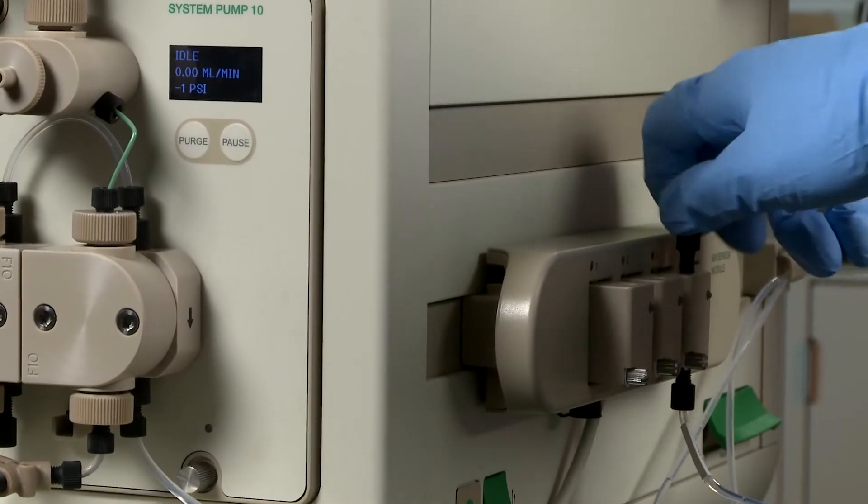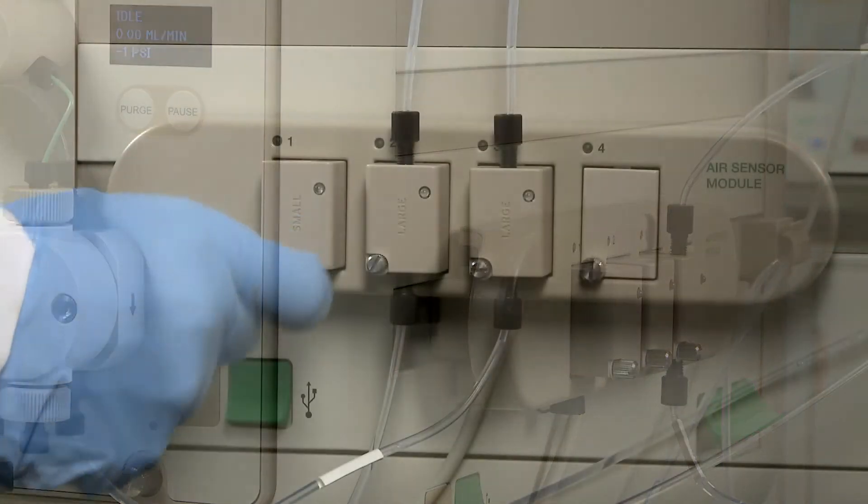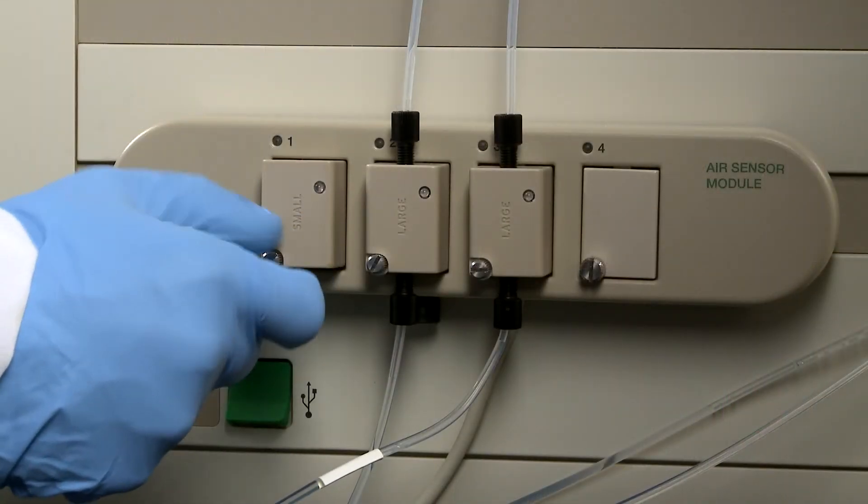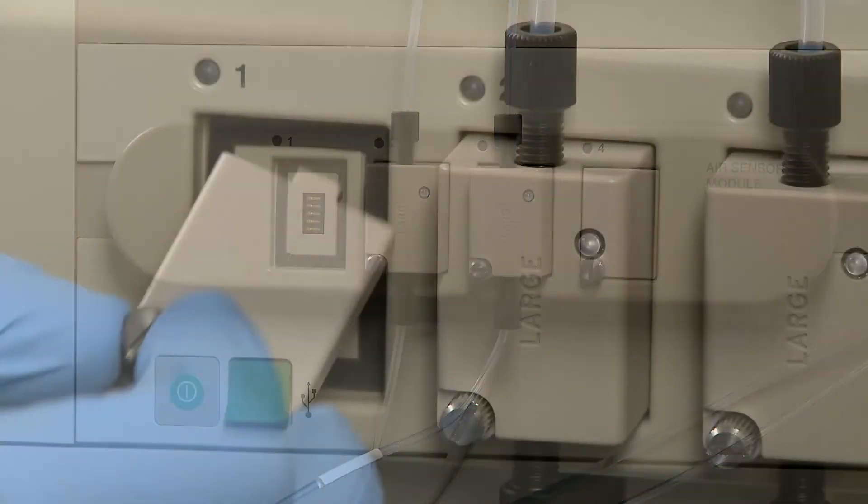Air sensors are plumbed directly in line for sample or buffer loading. Any air sensor that is not in use should be removed from the module and the empty connection bay should be covered.